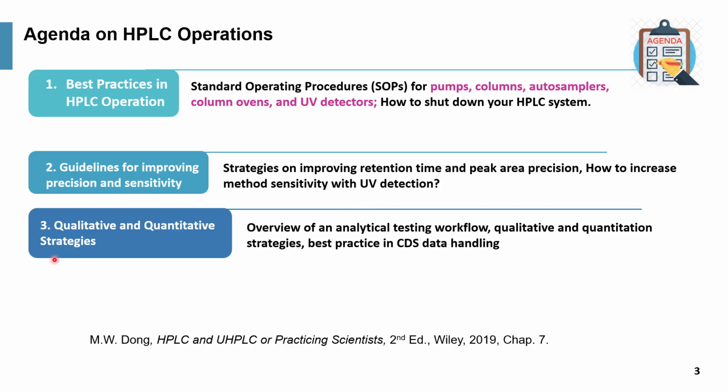The third one is on qualitative and quantitative strategies, including an overview of the analytical testing workflow, qualitative and quantitative strategy, and the best practice in CDS, which stands for chromatography data system, data handling. These will also be documented in the book, chapter number 7.